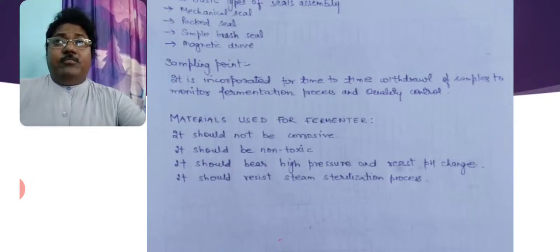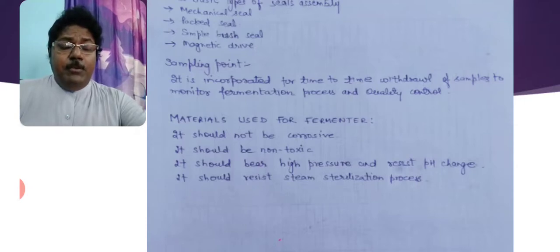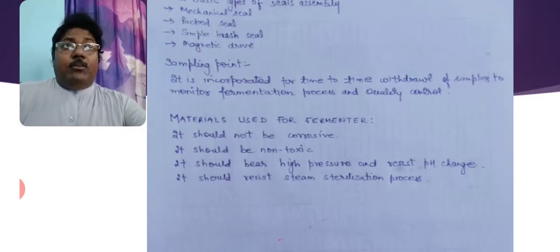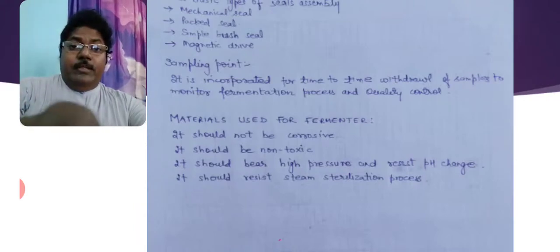We are producing various biopharmaceuticals like steroids, monoclonal antibodies, cytokines, etc. with the help of the fermentation process. And various food products are also produced by this process. So for effective fermentation processes, the effective fermenter design is very important. Thank you, dear students.